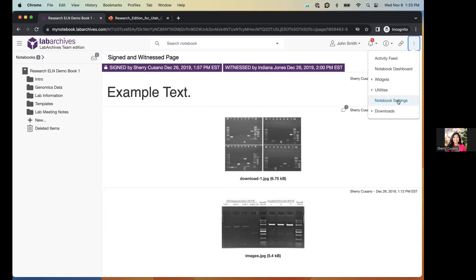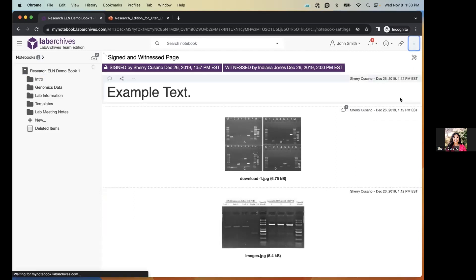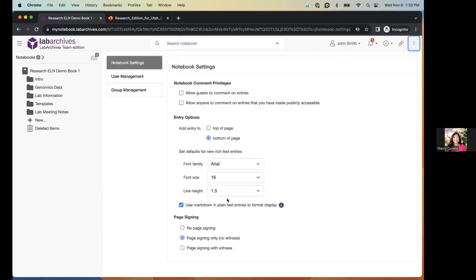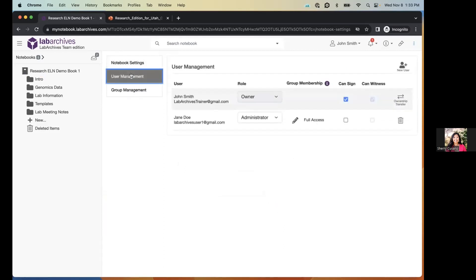If you are an owner or administrator, go to Notebook Settings. The first tab has simple settings like rich text defaults or whether page signing is allowed. Under the 'User Management' tab, you can see everyone with access to the notebook. By default, when you create a notebook, you're the only person with access until you add others.